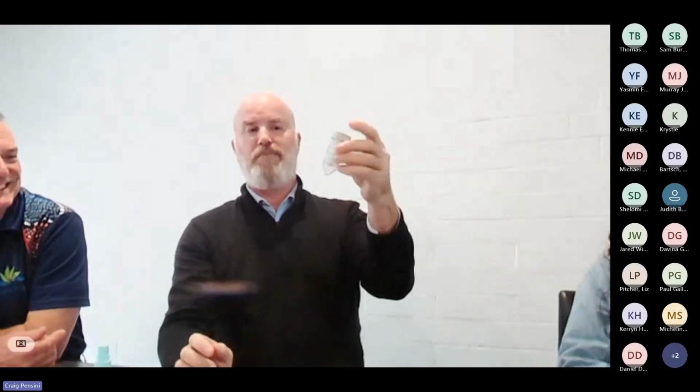So then what you're doing is, this is full of preservative. Then you're just popping it into the tube. Try to get this technique going where you can take off a lid with one hand. You're popping it in there, and because it's a bit tricky to take it off, you put the lid over the edge, and then you're pulling it out like that. You've done that once or twice before. I've had some practice. Yeah. And so that's your sample.